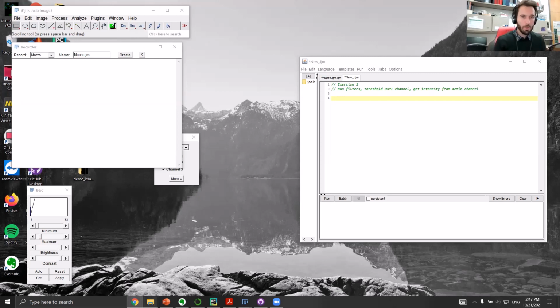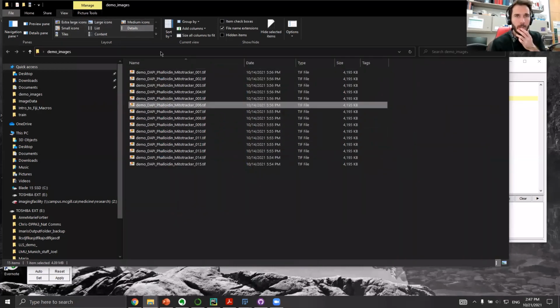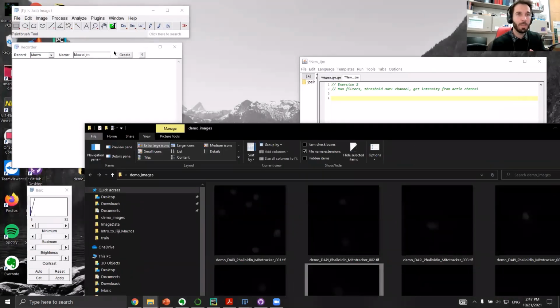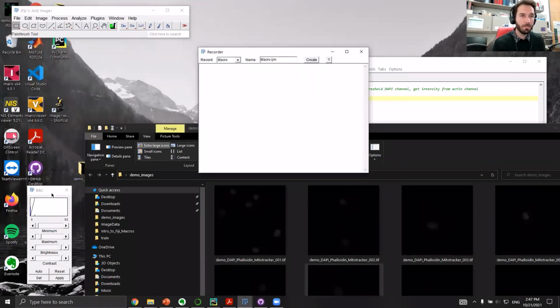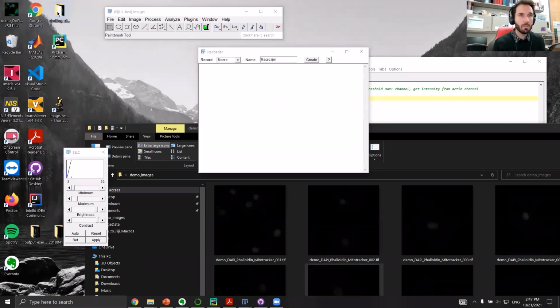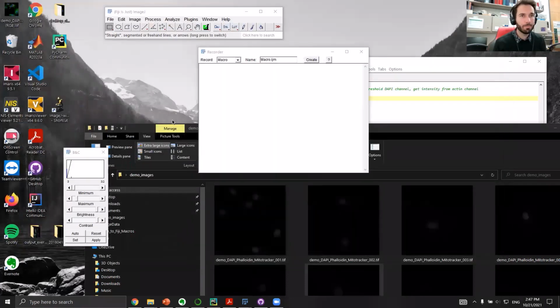So we'll open an image for this particular exercise. Let me go back to the large. Actually, I'll consult the nice folder of images that we have. Let's find an image with multiple nuclei. Oops, that was not right. Where's my output folder?